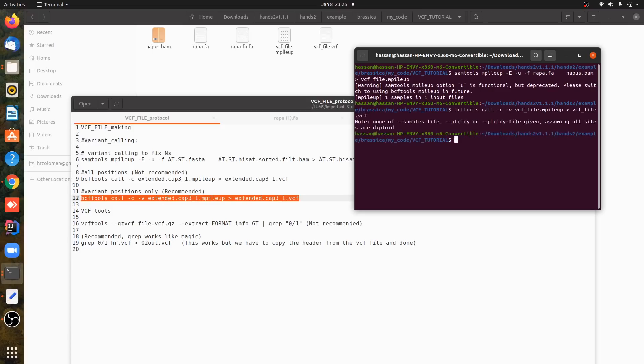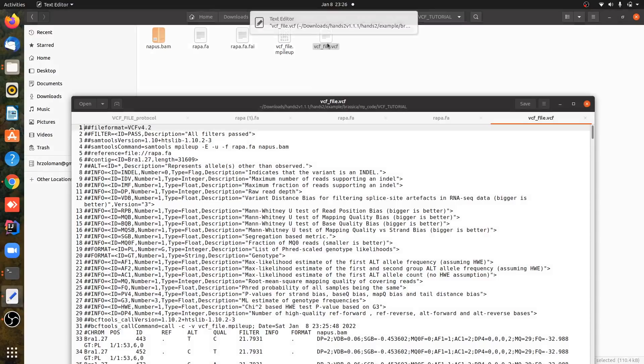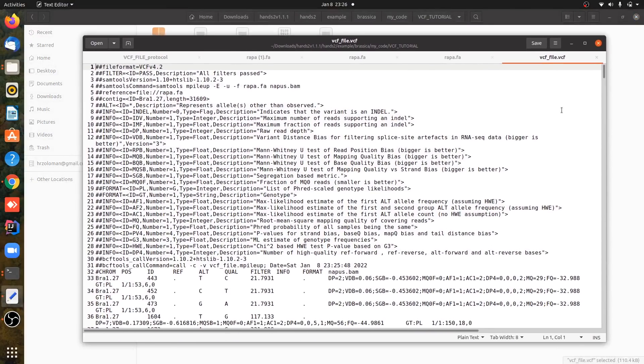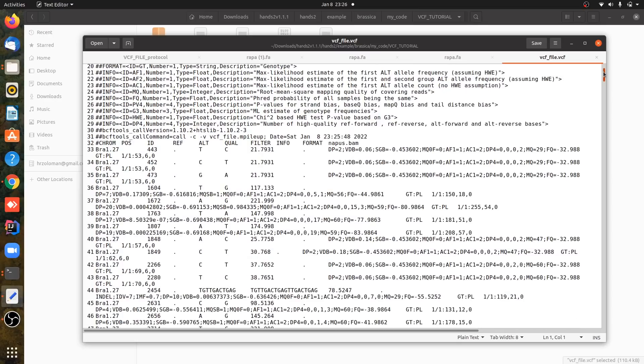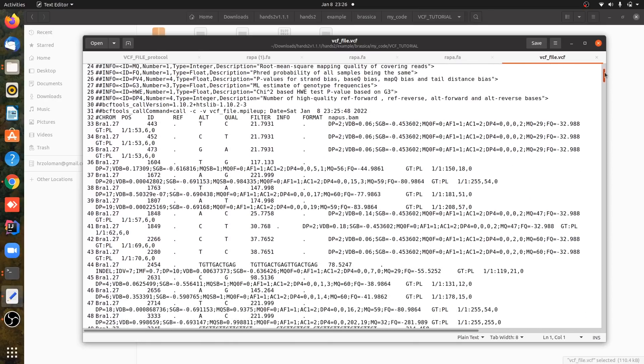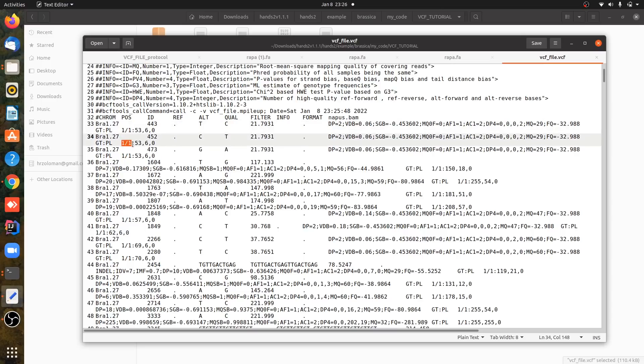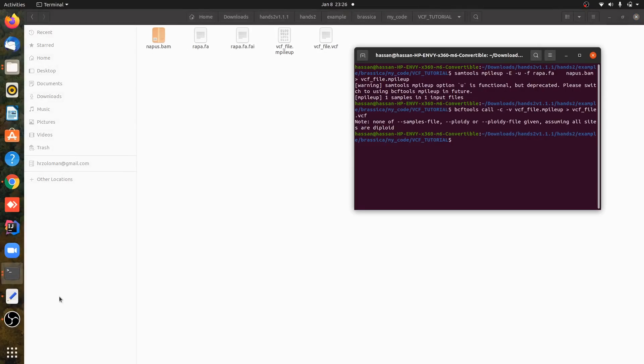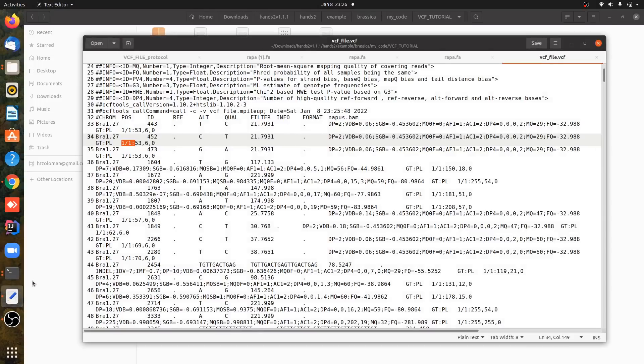So we have got a VCF file, but as you can see this is our VCF file and it has homozygous positions as well, one and one. So if you want to filter for heterozygous positions, then we can do that and we can filter it for heterozygous positions.